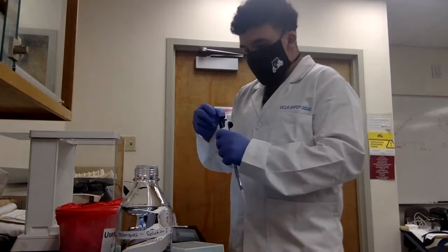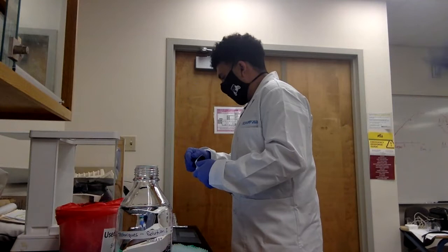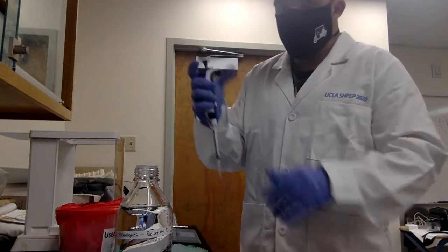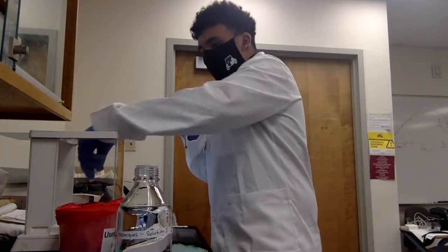Yeah, I don't recommend you put the tips on the paper. It is fine if you are doing this kind of experiment, but sometimes there is contamination. Sometimes when you do a sterile experiment, you need to keep it clean. Sorry, it's okay. Oh, that's zero again. Yes, because the mass of the tube is different.